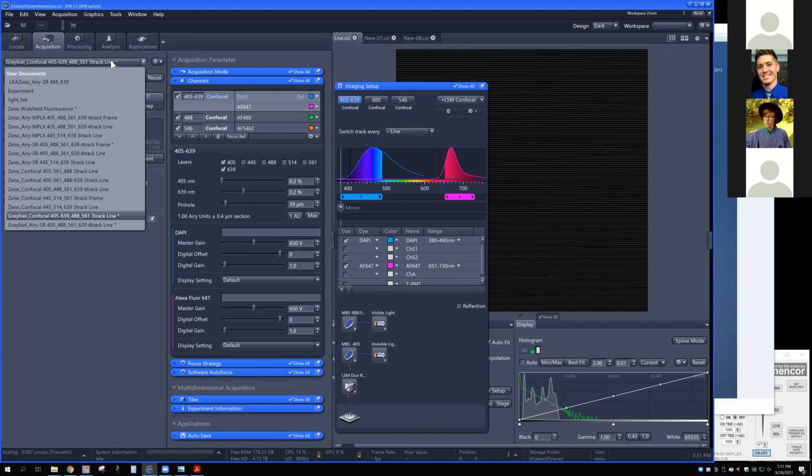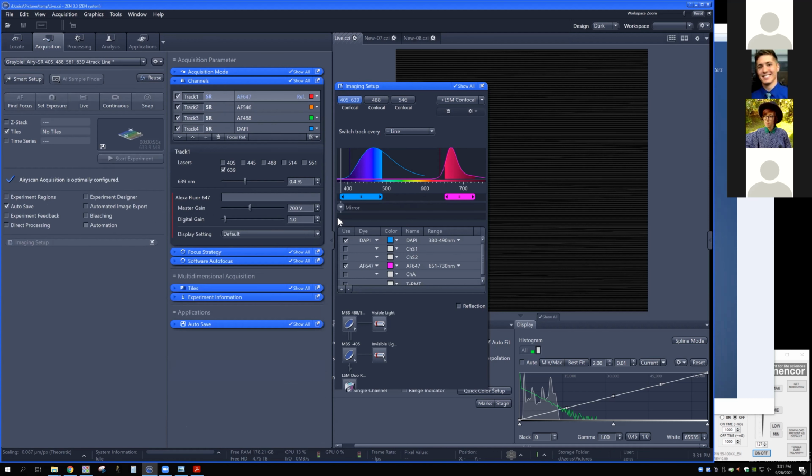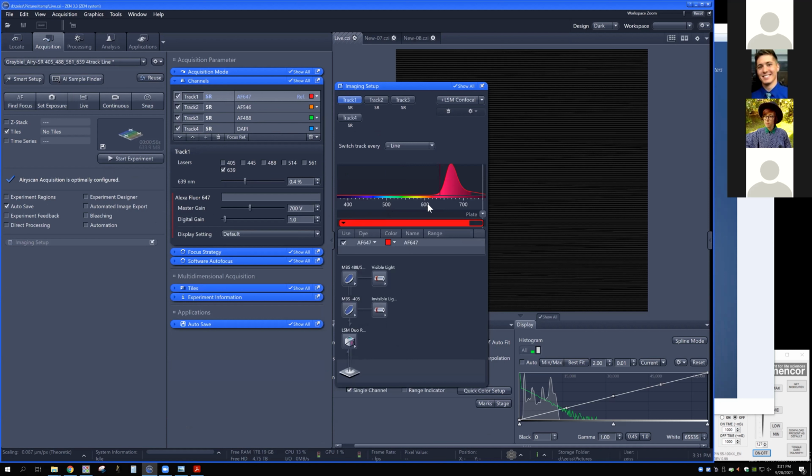Now, if I go back to the Airyscan configuration and show you what that looks like, here you can see we no longer have those sliders anymore, but we do have basically our choice of the same first filter wheel. So we have a mirror, we have a plate, which is just a glass plate, which would let everything through.